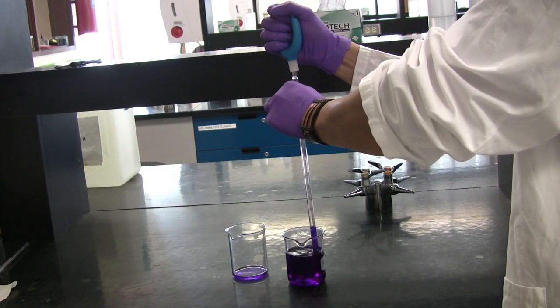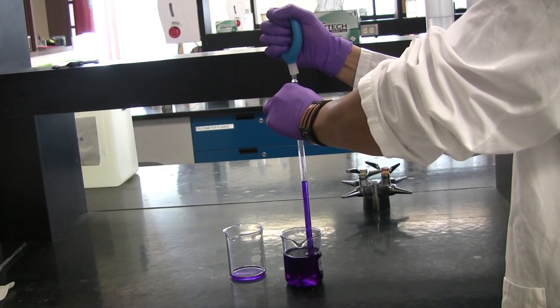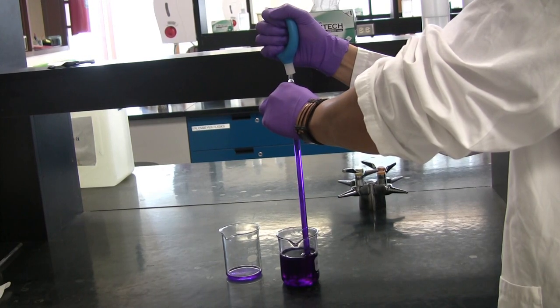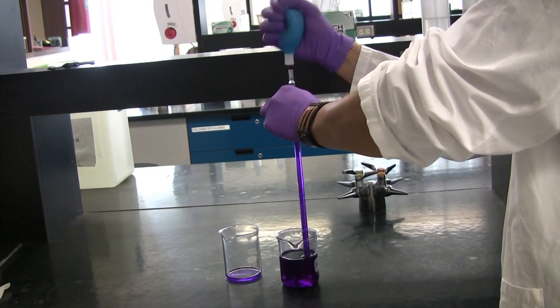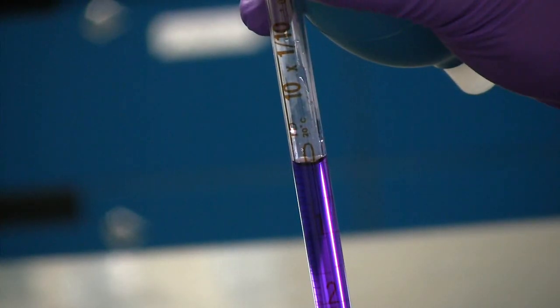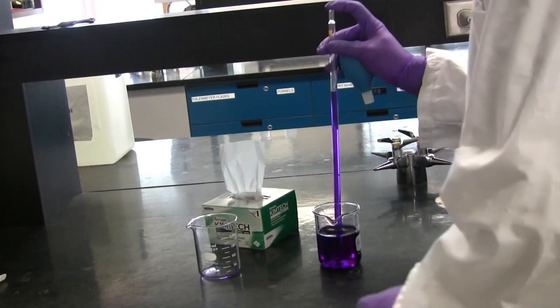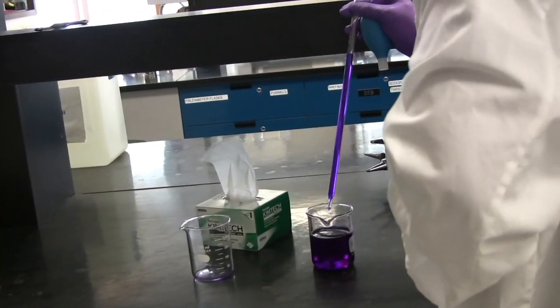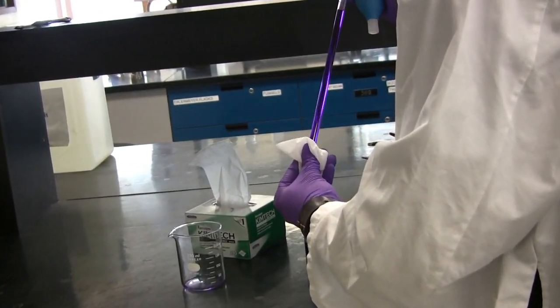Start off using your pipette bulb to withdraw your solution into the graduated pipette. Make sure to stop at exactly the zero point, as indicated here. Next, take it out of the solution and wipe off the excess with a kim wipe.